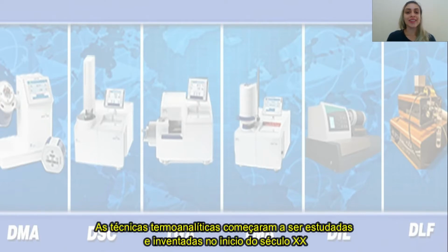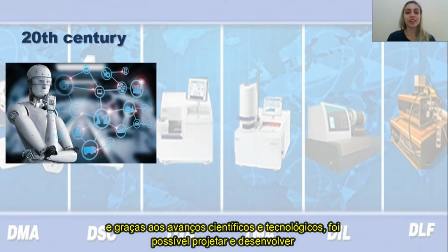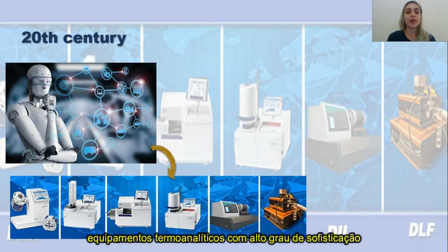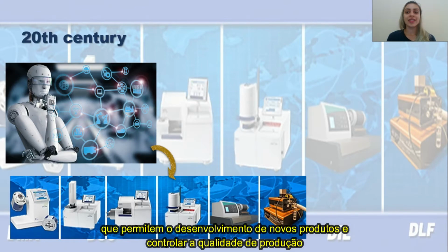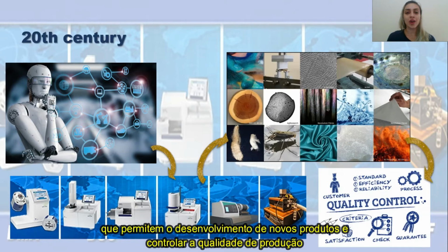Thermoanalytical techniques started to be studied and invented at the beginning of the 20th century, and thanks to scientific and technological advances it was possible to design and develop thermoanalytical equipment with a high degree of sophistication that allows the development of new products and improves quality control.